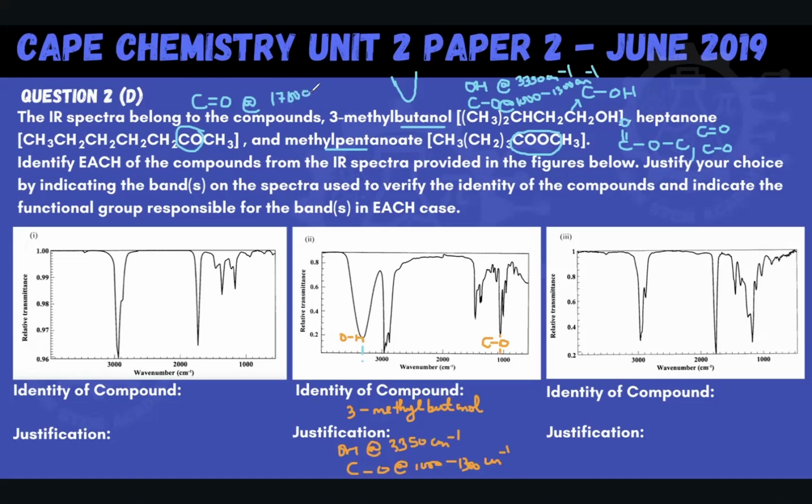Again, you could have gotten this number from your data booklet, that ketone carbonyls are around 1,700 cm to the -1. So I'm going to look for plots where that is a very sharp peak. Again, the transmittance is low, which means the absorbance is high down here when it's coming all the way down. And that's what we want. Those are what we call peaks, sharp peaks. So here's a sharp peak. That's at 1,700. So that could potentially work.